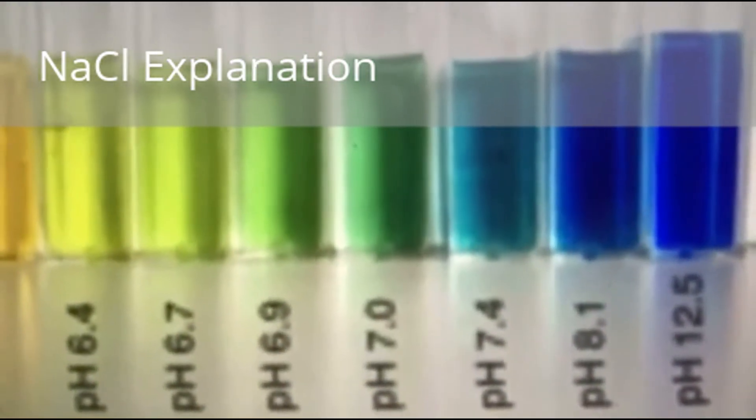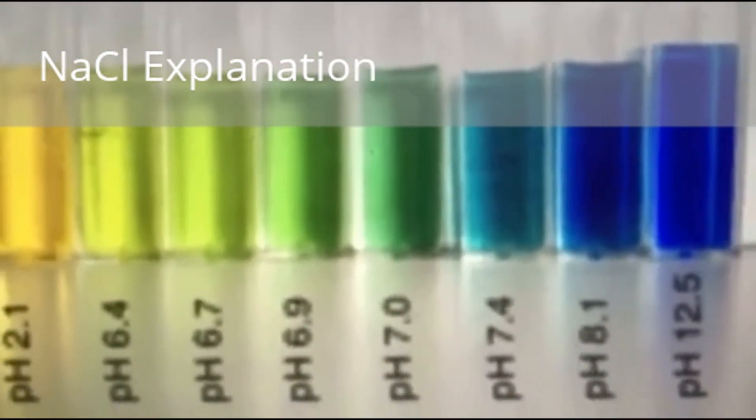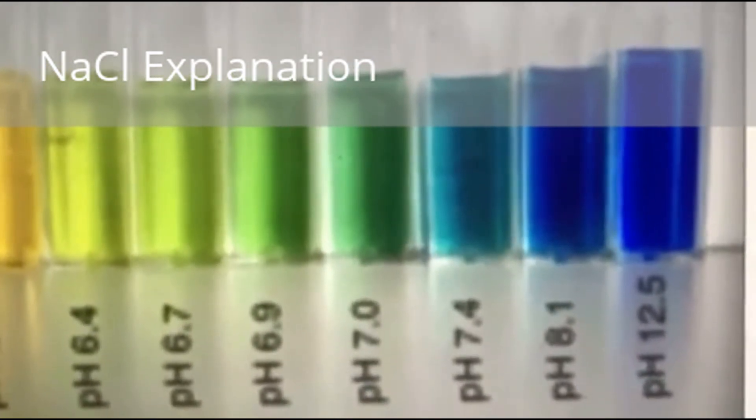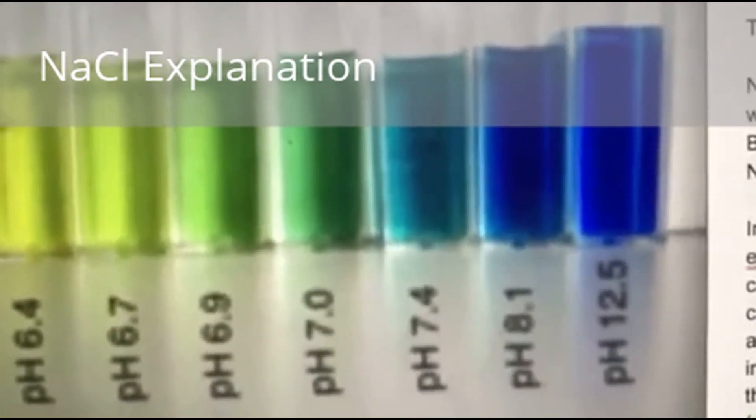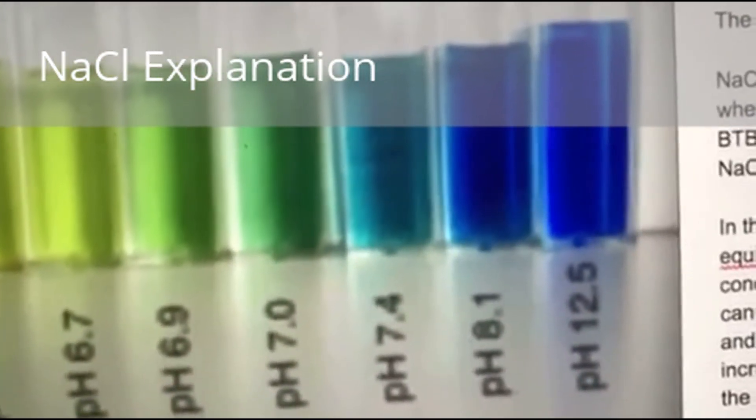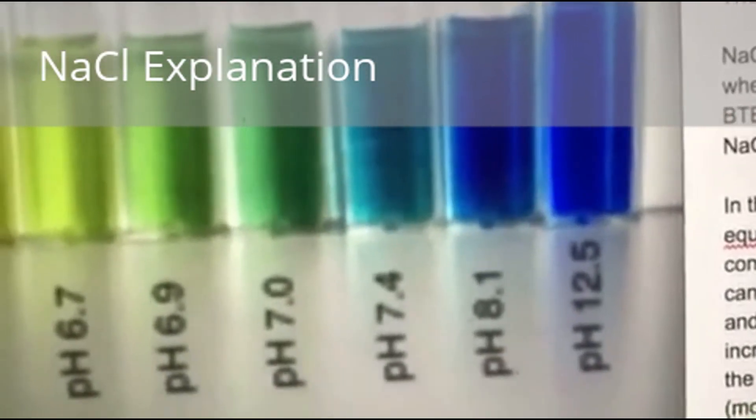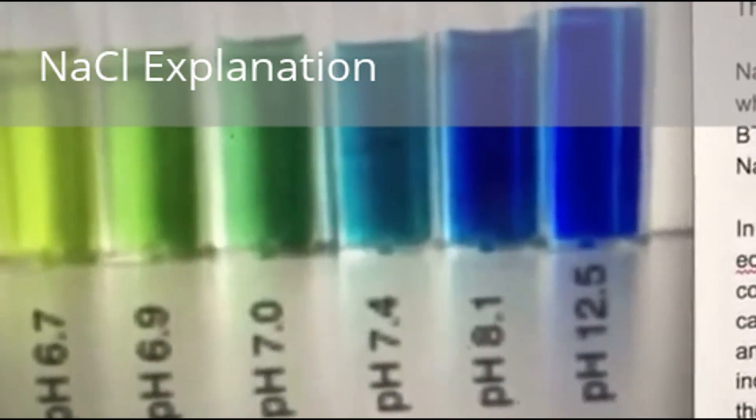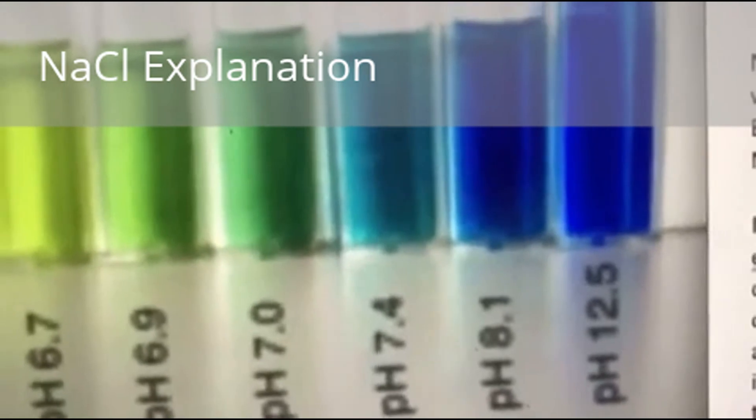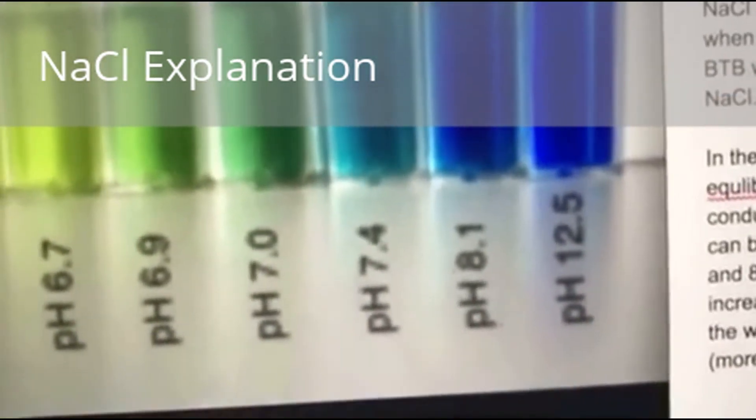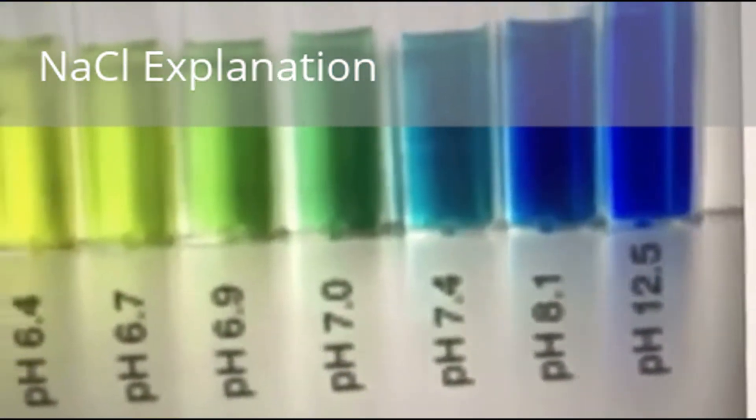Lastly, we will talk about the effects of NaCl on the BTB solution. NaCl is an ionic salt, which is neutral, so it has little to no effect on the reaction. We observed in the experiment that when we added one to three drops of NaCl to the BTB, there was no color change. This means that the pH of BTB was not affected.